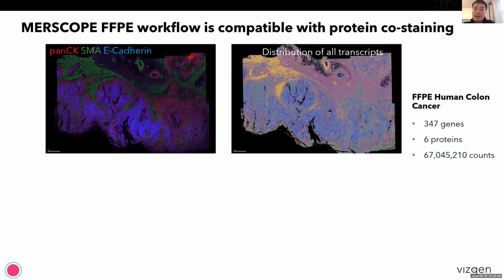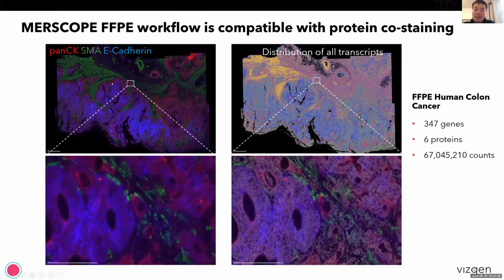This chemistry is also compatible with protein co-staining. Shown here is FFPE human colon cancer with 343 genes and six protein co-stains, with around 67 million transcripts detected across the tissue. On the left is the distribution of three selected proteins — PanCK, SMA, and E-cadherin — and on the right is the distribution of all transcripts overlaid on top of the protein imaging. The protein co-staining integrates very nicely with the RNA imaging.